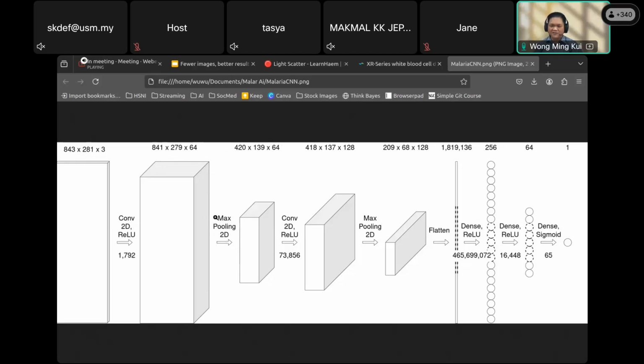So this is a new shape of the data now. This is the second convolutional layer, and after it we get this shape of data, and finally, again the pooling layer, and we get another shape of data here.